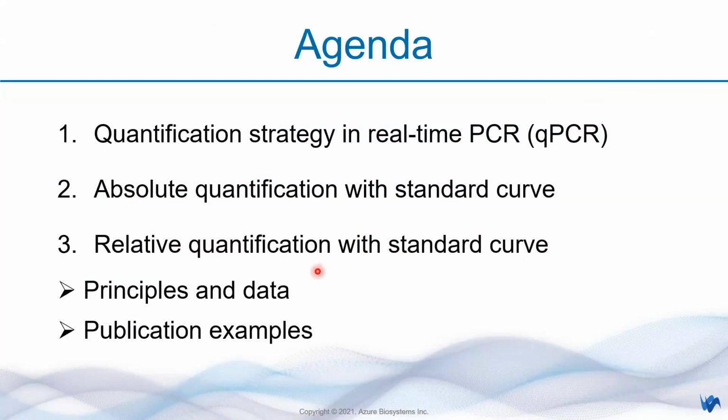With relative quantification, the standard that you use can be anything, and you can use unknown samples as well. Basically, they are mostly unknown samples, and you just need to do the dilution accurately. That's it. And we have talked about several publications and how people improve on these strategies.